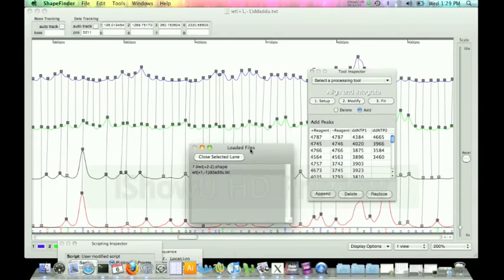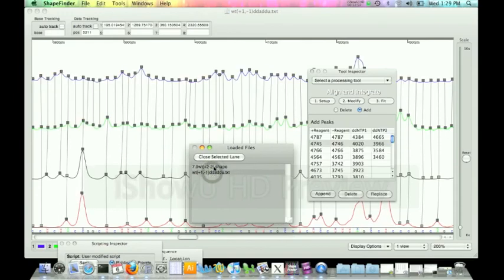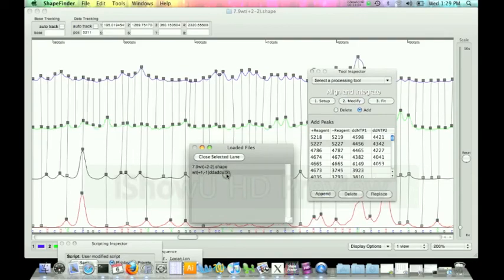So now what you want to do is, if you're doing multiple runs of these experiments, I already have a second set that I've already done. So this is our wild type +1, -1. We have a second run that we have completed, +2, -2. So if you look, you can click back and forth. Right now I'm just going to undo the fit. So if you click back and forth, you can see that essentially the peaks are in the same spots.